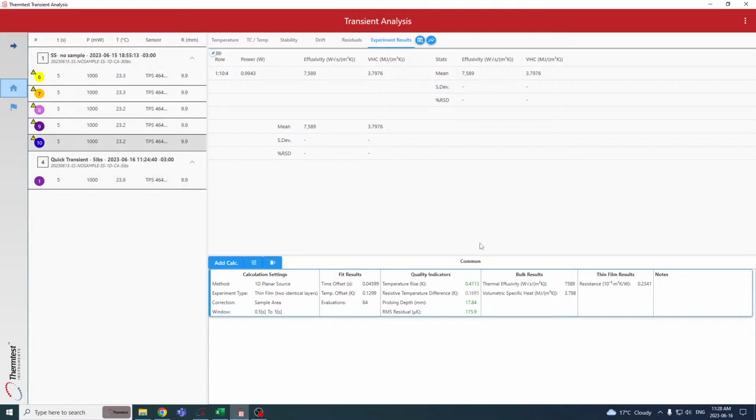So if we compare that 0.23 at 30 pounds to the same experimental setup at 5 pounds, you would expect the resistance to be greater, which it is. It's 0.26. That's the contact resistance between stainless steel and stainless steel when one surface is polished and the other surface is sandblasted.